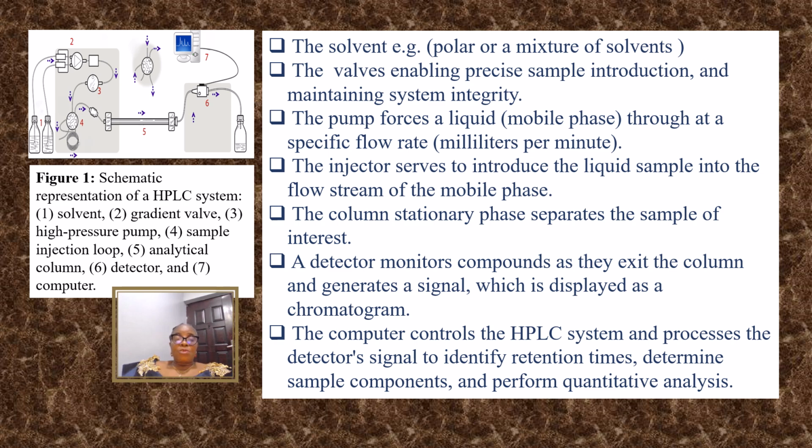The solvent is used to elute the sample through the column. It can also be a mixture of solvents. Water, very polar, can be mixed with acetonitrile, less polar, in a ratio of 70 to 30. Single or several samples can be run in succession by loading in the autosampler without any human interference.